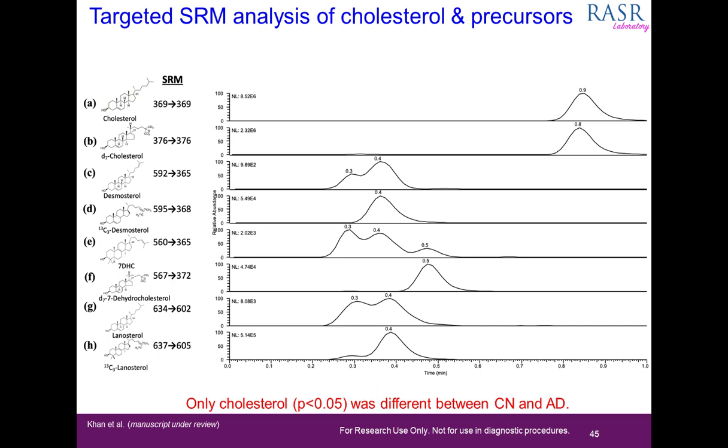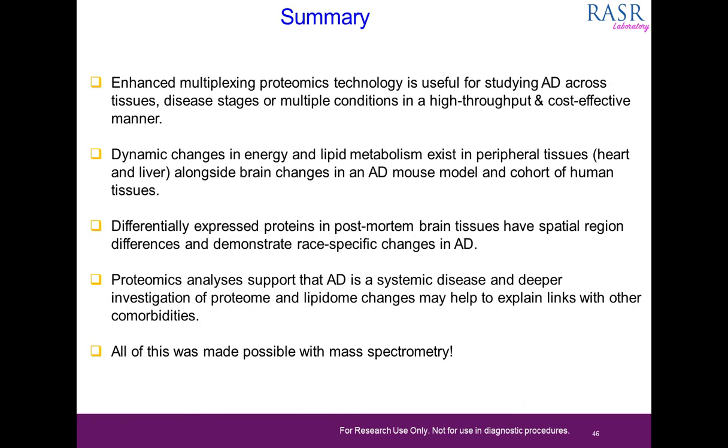So this is done in collaboration with a colleague here at Vanderbilt, Ned Porter. And for these studies, the only species in this pathway that we observed a difference for was cholesterol between the cognitively normal and the diseased individual.